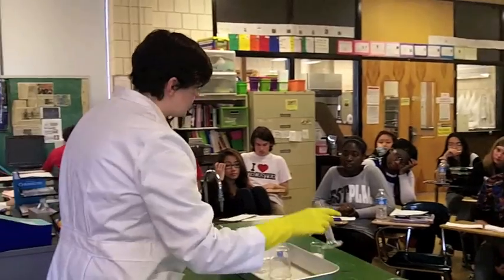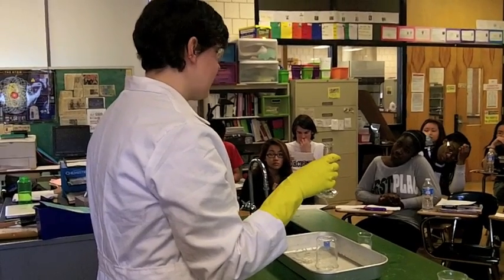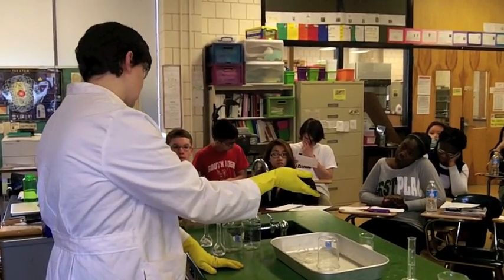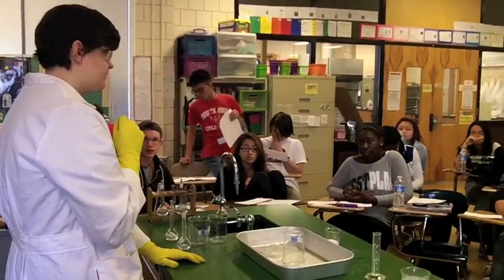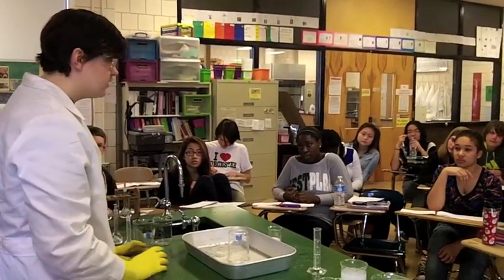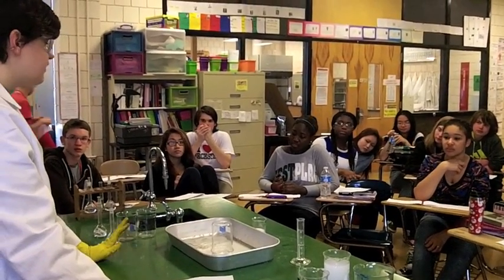I'm going to tell you something about sulfuric acid. This is concentrated sulfuric acid, so it's pretty much as concentrated as it can be. It's very strong. When we pour sulfuric acid onto something that contains water, onto sugar for example, it's going to dehydrate it. What does dehydrate mean? Suck out the water. So if I am sucking out the water from this sugar, what's water made of? H2O. If I'm sucking the water out of this, what am I going to be left with? Carbon.